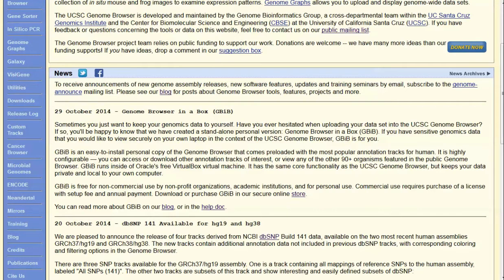The Genome Browser in a Box offers a bunch of different options for you to work with your files locally. And it doesn't require you to get the bioinformatics geeks to set up a local installation of the UCSC Genome Browser. You can run this all yourself on your own computer.